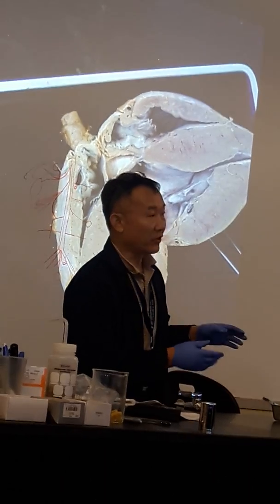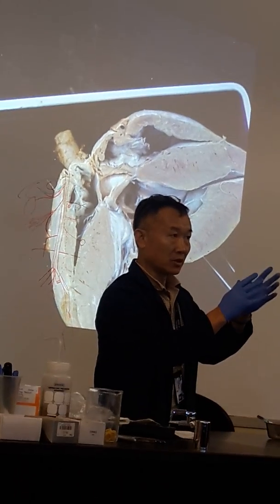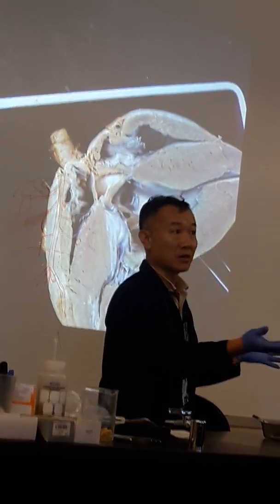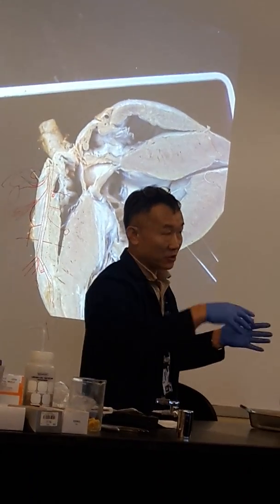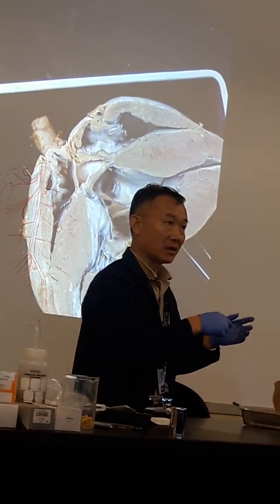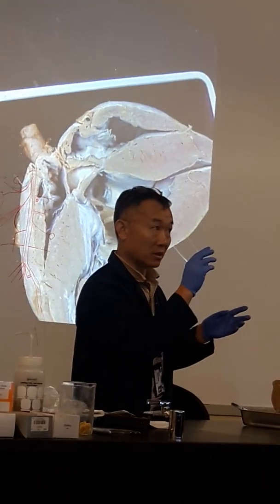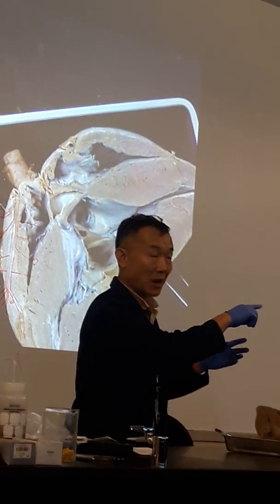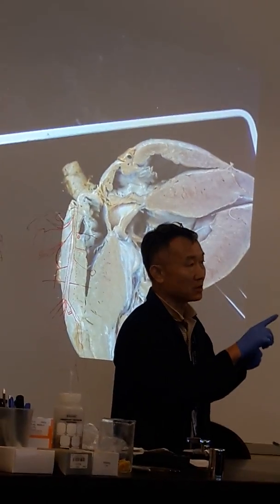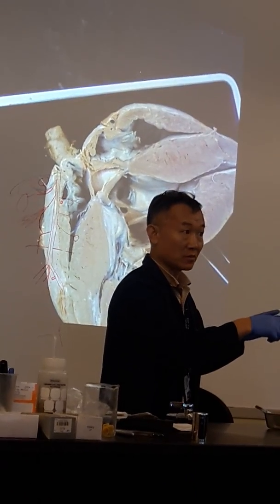You don't see that. Foramen ovale is the hole between the fetal atria. So blood bypasses from right side to the left side because there's no need to pump most blood to the lung. Lung is not open. So partially some blood passes from right atrium to the left atrium. Even some blood gets into the right ventricle, which passes from pulmonary trunk, they're still passing another bypass getting into the aorta. So there are two shortcuts to get into the aorta when the baby is not born, fetus.